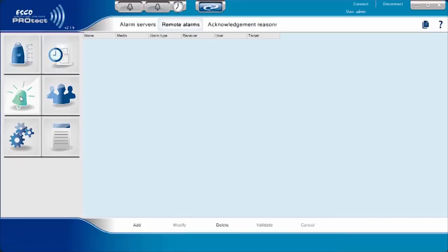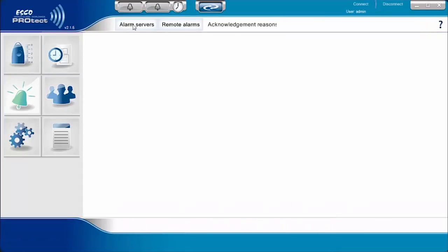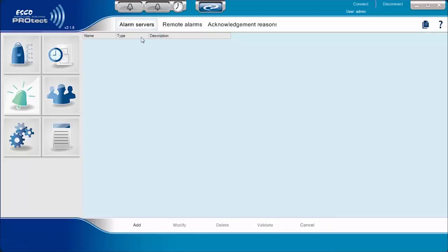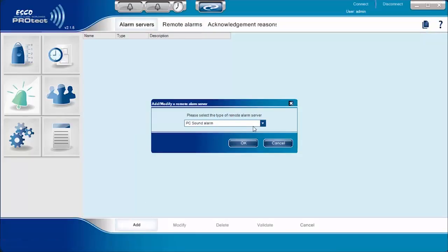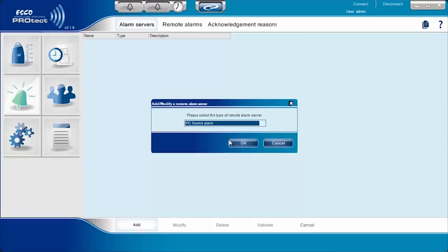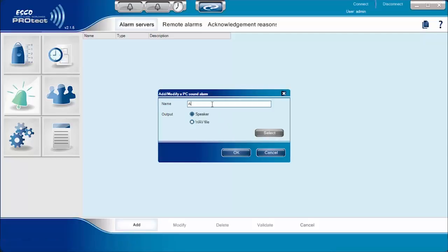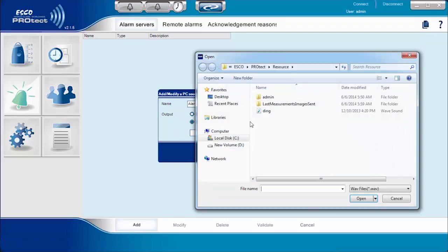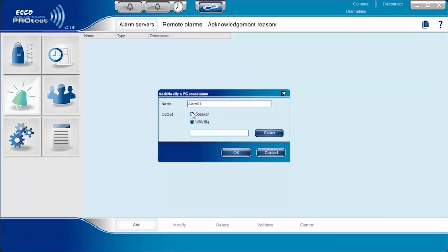Alarm management can be set up by selecting the Alarm Management icon on the left side of the screen. There are two ways to set up alarm systems: via alarm servers or remote alarms. Using alarm servers provides users an option to choose what type of external alarm they want to use — it can be PC sound alarm, vocal telephone transmitter, SMS server via internet or modem, email server, or MMS server via modem. For this particular example, we set up a PC sound alarm using a WAV file output. Users can also choose a speaker as an output for this PC sound alarm. Once finished, always click Validate.